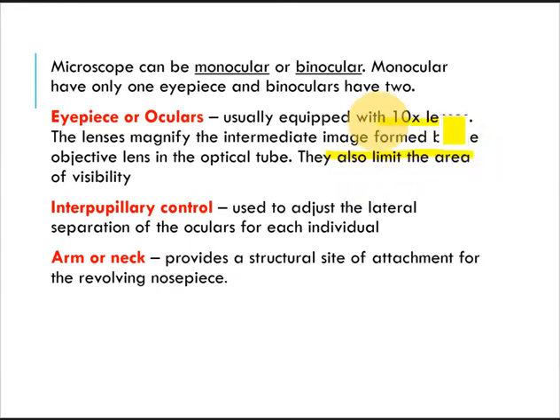So take note of 10x. I already told you a while ago, when we discussed the microscope, that the total magnification is the product. Do you remember? Good. I hope you remember. Father of microscopy?